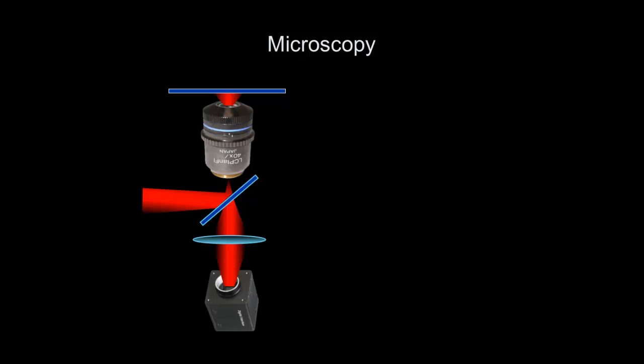Okay, so this lens can really give you an interesting magnification and high resolution. Those are two different things, by the way. You have a magnification, which is how many times you amplify the image, and you have a resolution, which is like resolvable features. This lens does both of them, so it can actually magnify the area you're looking at. That's one. But number two is it can actually resolve features with high definition. Okay, so this is a regular way of doing it. You send light in, and you just literally take an image from here, project it onto a camera, and then you get images like this.